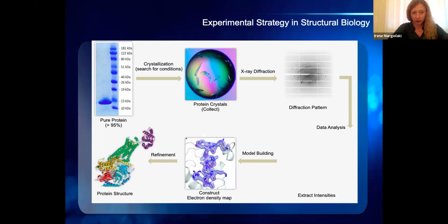So in structural biology, which is a very hot topic these days for understanding how coronavirus affects humans, we don't work with natural proteins. We express them in bacteria, usually E. coli. After expression, you obtain a family of expressed proteins. So one needs to isolate the protein you want to study, and we do that via liquid chromatography.